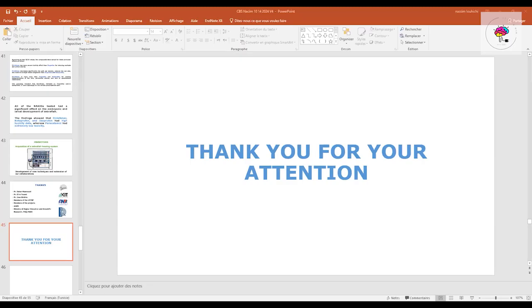Okay. So I think the last idea that Nassim showed is what we call husbandry, like a housing system, like this one. You can keep the fish without a lot of manipulation. This is what we aim to do. But compared to Tunisia, this kind of thing is a little bit expensive. They are like 20,000 to 30,000 price for each unit.